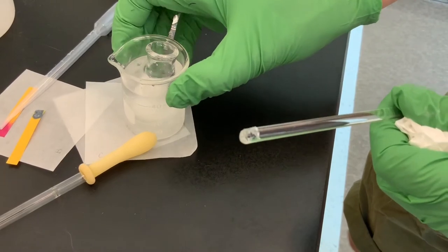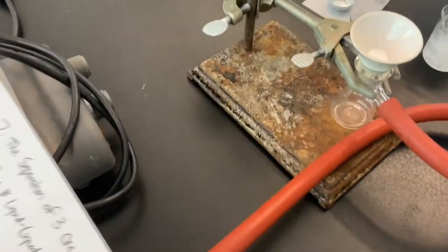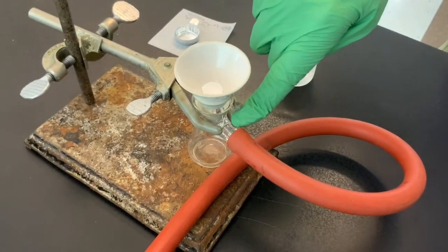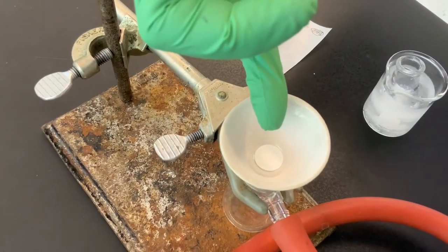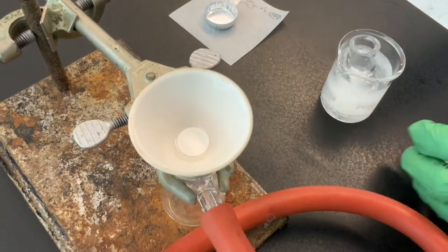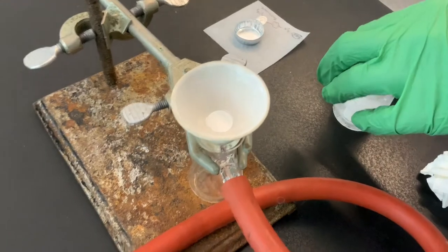So we're going to migrate over. We've already set up our Hirsch funnel connected to our ring stand, right? And here's our rubber tubing connected to our sidearm filter flask. And in there is already Whatman filter paper. So I'm going to turn on our vacuum. You can even hear it. And we're going to try and quickly get everything over in there.